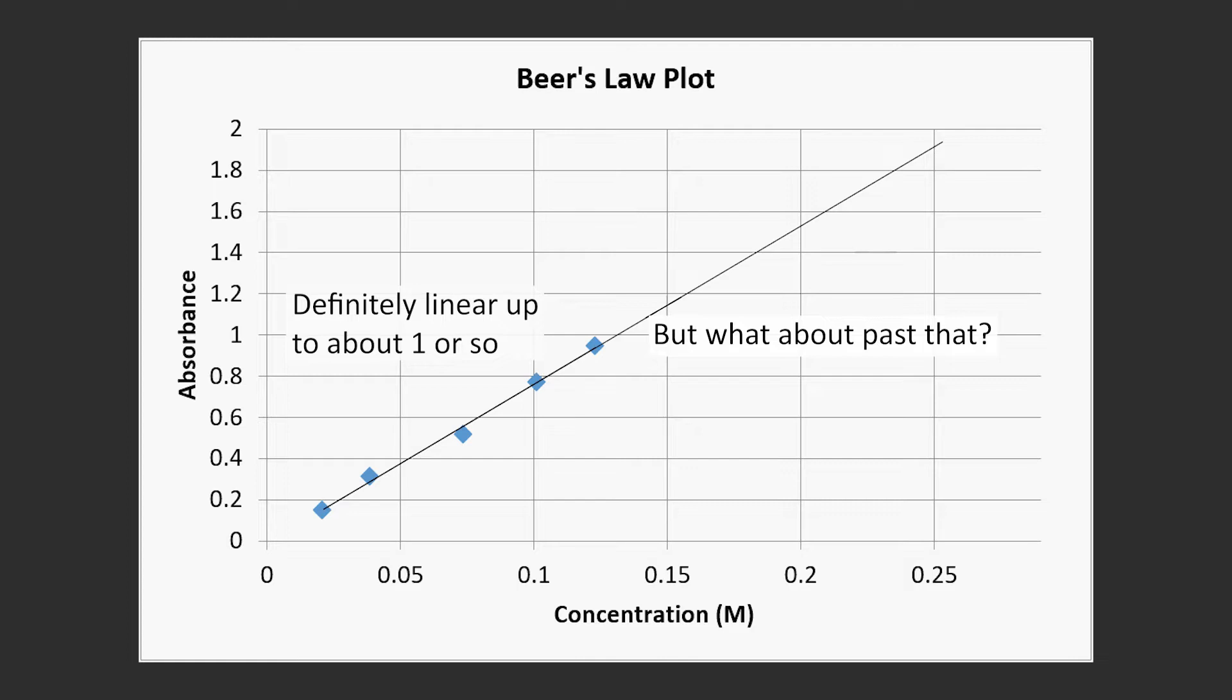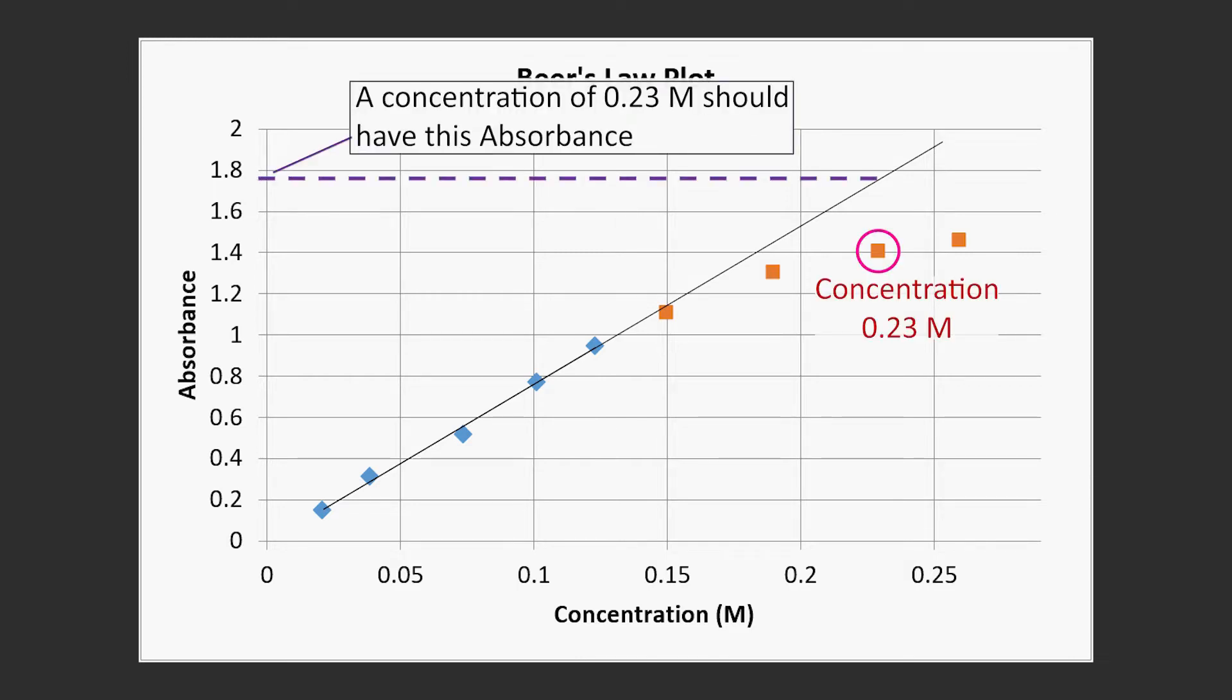See, as a solution's concentration increases to somewhere past an absorbance of 1, the absorbances we measure begin to diverge from a linear line. For the example shown in this graph, if we tried to measure a solution with a concentration of .23, we should theoretically get an absorbance of 1.76 or so.